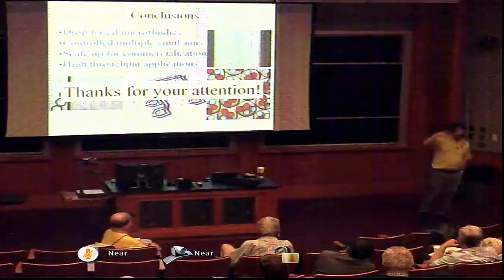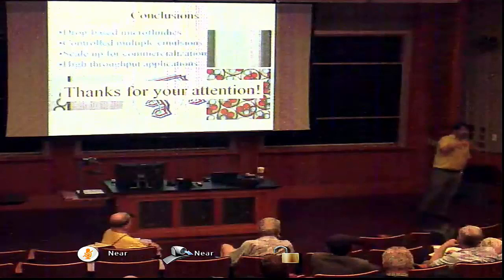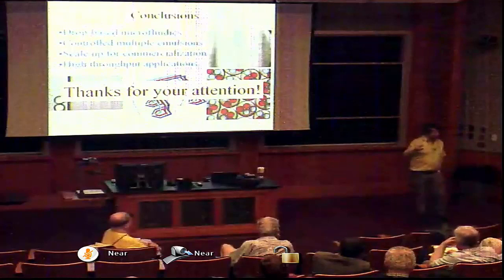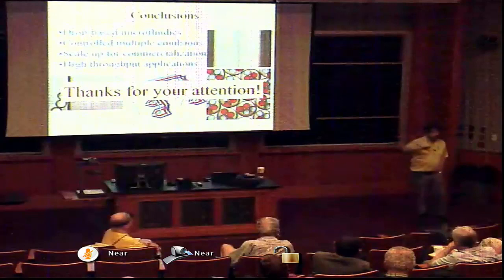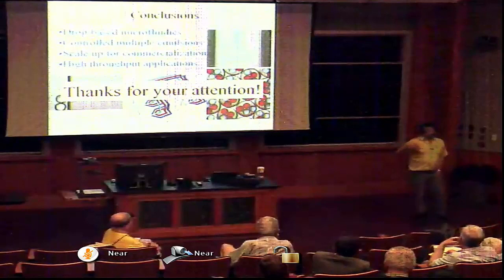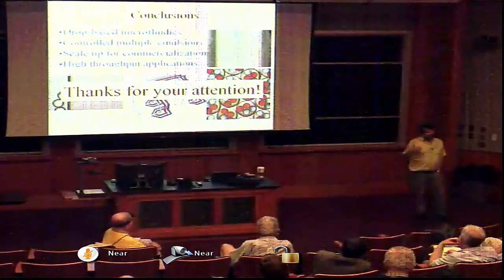There's a technology called liquid biopsy, where you look in the blood for the cancer cells. So you look for circulating tumor cells. They exist roughly at 1 per mil. In a mil, you have 10 to the 9 cells. Some colleagues of mine at the Microfluidic Cancer Center built some beautiful devices, as other people have, that enrich those cells. We take those enriched cells, put them in the drops, and we're able to detect these things very, very sensitively.